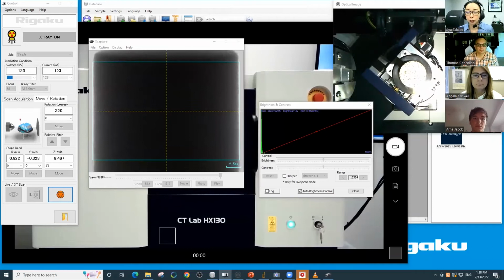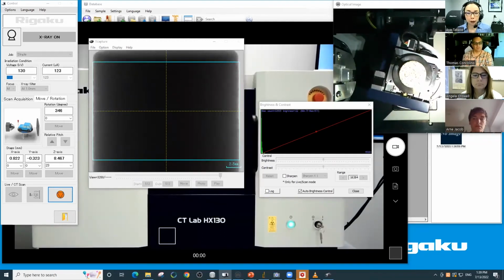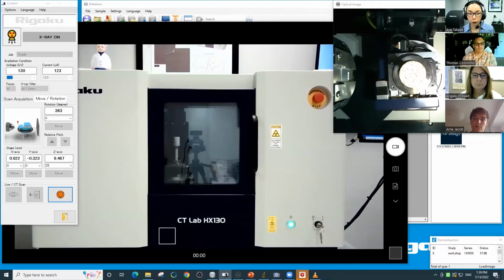That's a very good question. You can start with 5 times the representative grain size, or mean grain size, let's say. And it's always good to check different areas to make sure that that is a good representation. That's one thing to think about.